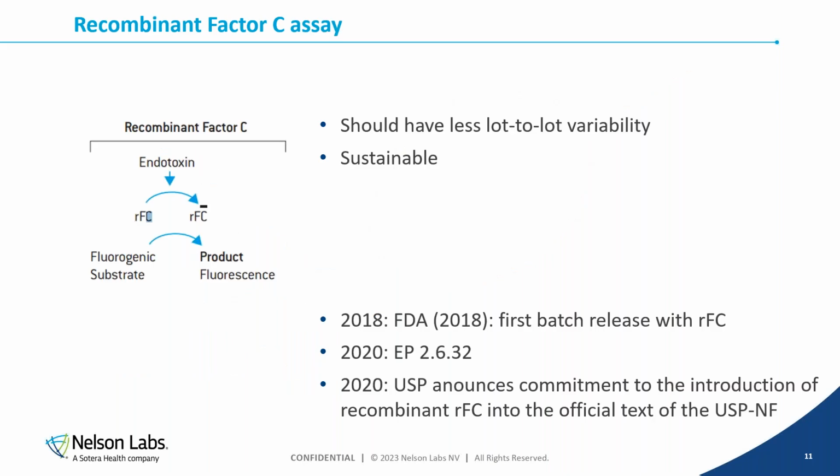Just a quick word about the recombinant factor C assay. This is not new, but its approval is quite new. From 2020, it's part of the EP. There is already a guidance at FDA. It's not in the US Pharmacopoeia, but since 2018 it is being used for batch release in the US.